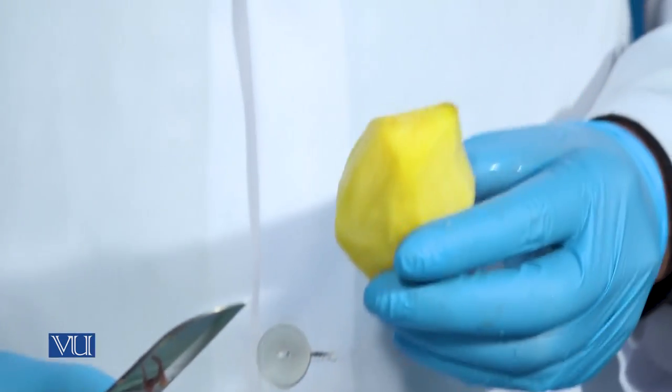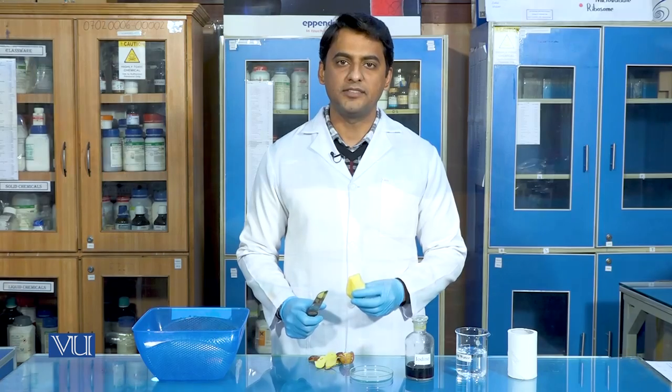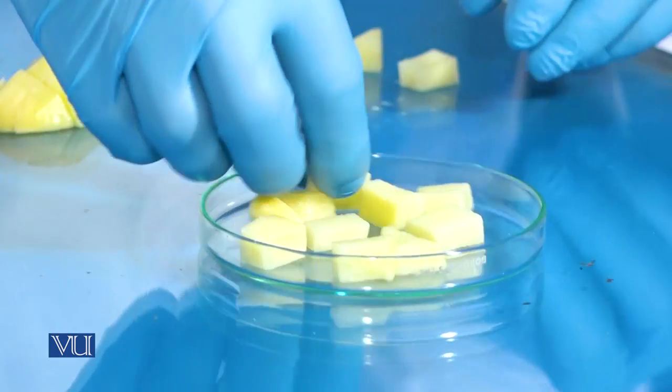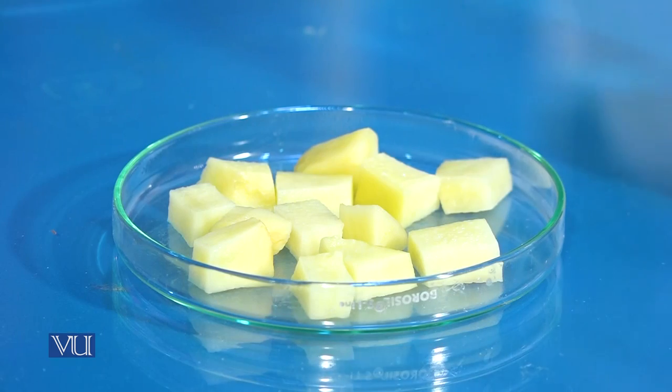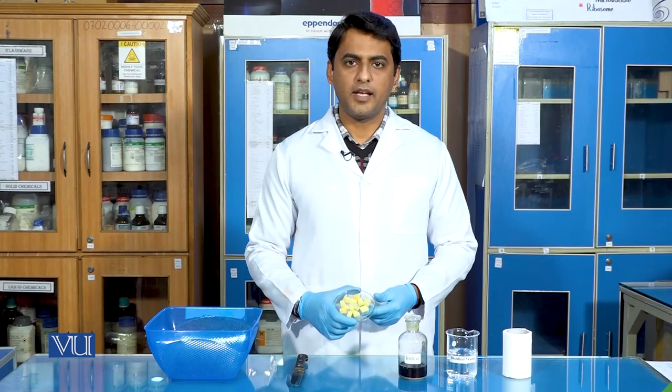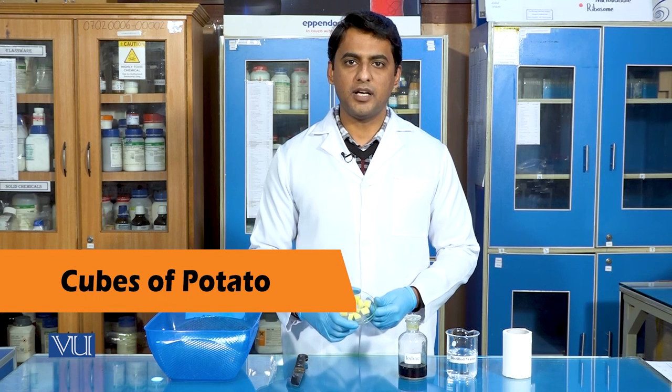After peeling the potato, we will now cut the potato into very small pieces. As you can see, we have converted the potato into very small cubes.